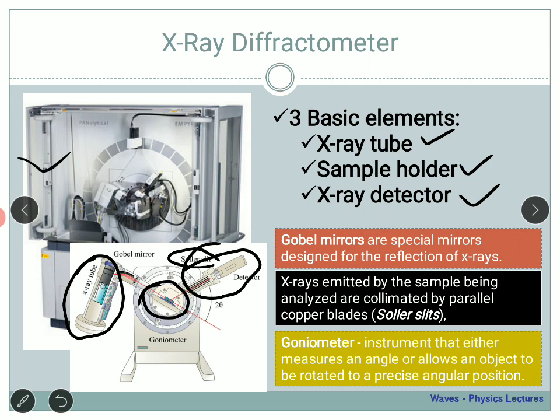This is how a real machine looks like. This belongs to PANalytical, the PANalytical company. It basically uses a configuration which is theta-theta or theta-2theta depending on what kind of machine we are using. Here also we have this, and this entire setup is basically called the goniometer. So you can look into this term, the goniometer. We are going to look into more details of that.